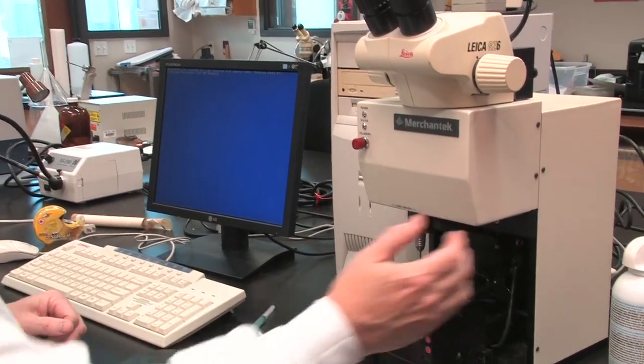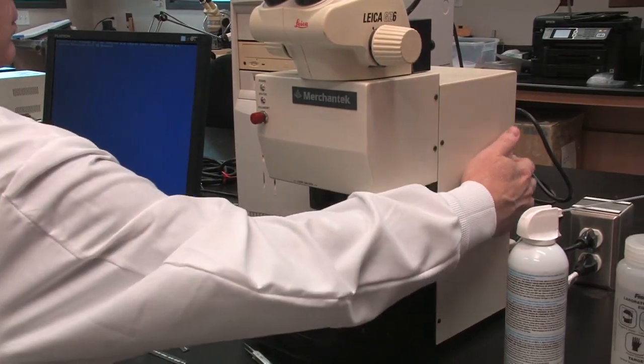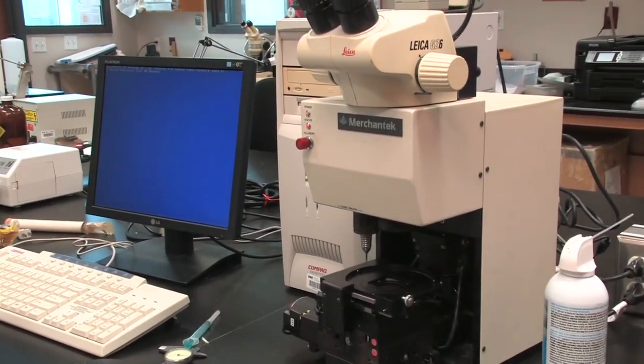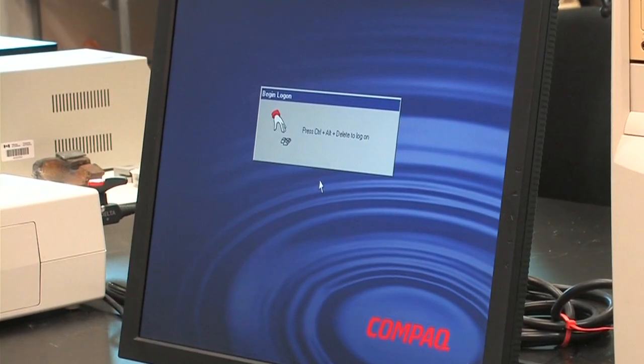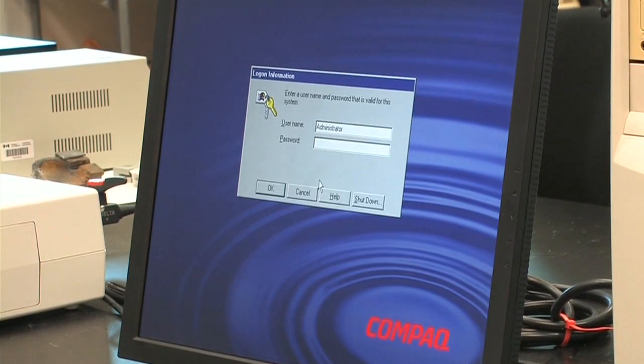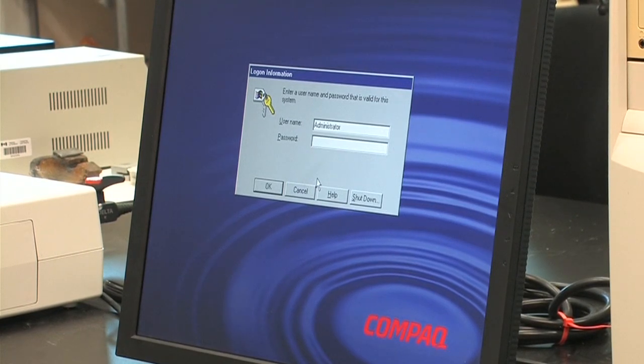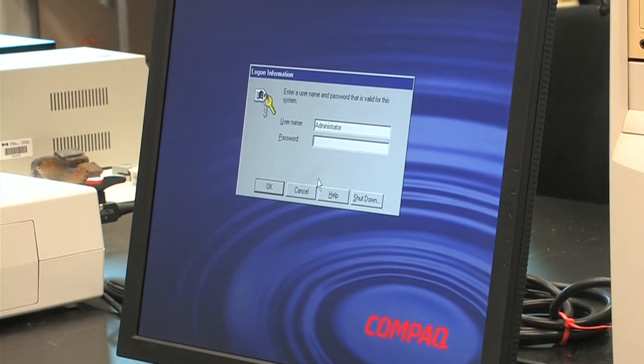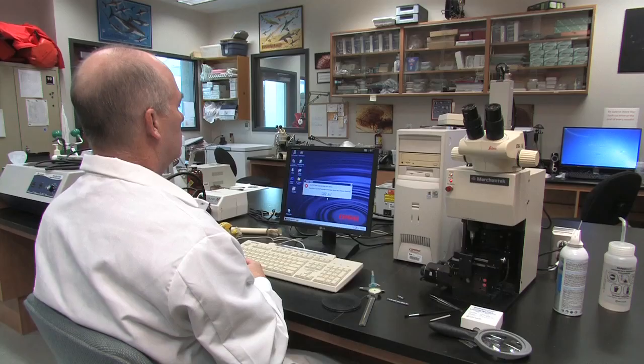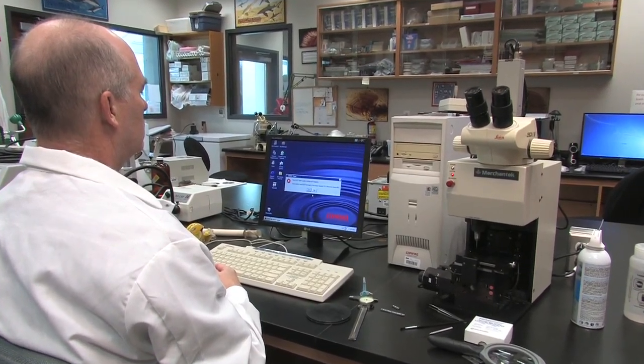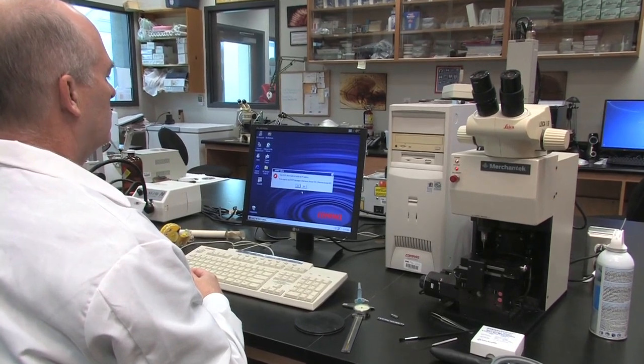The power button is located at the back and to the lower right of the machine. Press Ctrl Alt Delete as indicated by the screen. When the login information window appears asking for an administrator login, don't bother filling anything in and click OK. Another window will appear concerning the DHCP client. Choose no.